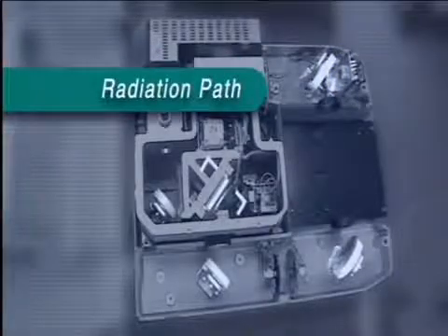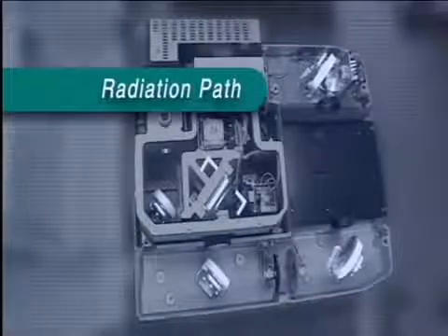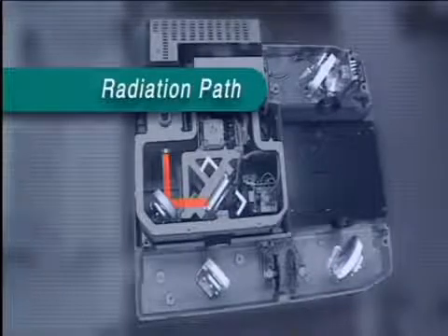Modern instruments, such as this one, use a device called an interferometer, consisting of a beam splitter here, and a pair of mirrors at right angles to one another.